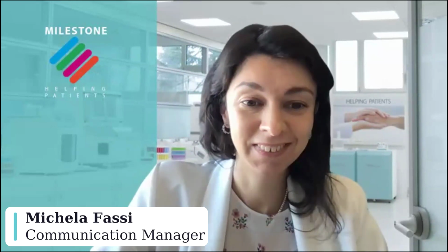Thank you again. I think we have time for one final question, and all other questions have been answered. So one final question for you, Irene, for the moment. Yes. I do understand the concept of lean workflow, but I think that you need to have a lot of small samples to be able to implement it. What can we say about it?